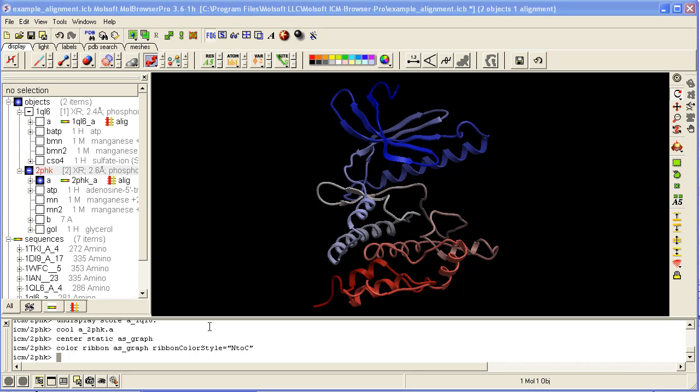How to convert an X-ray structure into an ICM object. You can do this by first loading your PDB file through the PDB search, and you'll see that this is an X-ray structure. It has XR here, and it's not an ICM object.